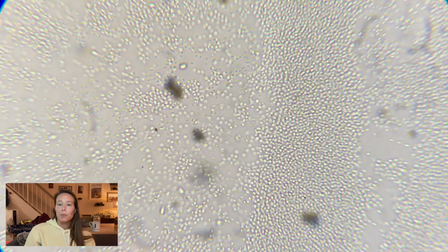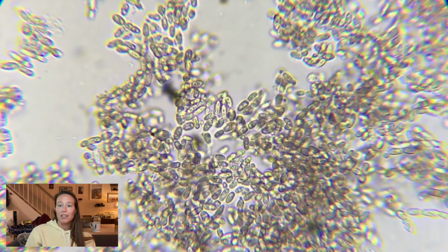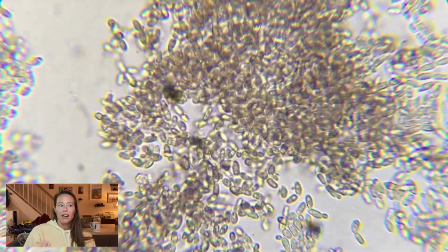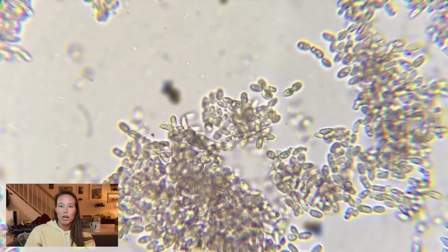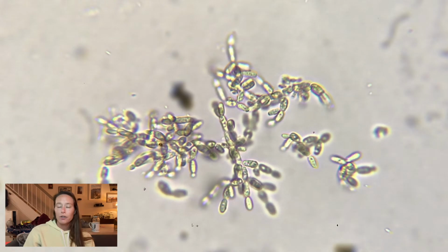This is really interesting because depending on where I take samples will completely affect the microdiversity of what's on the slide. When I took a sample from a little higher up in the jar, I was just getting tons and tons of bacteria with very little yeast. When I took a sample from a little bit lower in the jar, I was getting a lot more yeast. However, as I said, their cell shape had changed and there were no longer those dancing bodies present. And the colonies of the yeast had much more of a branched growth, more like a snowflake growth form.